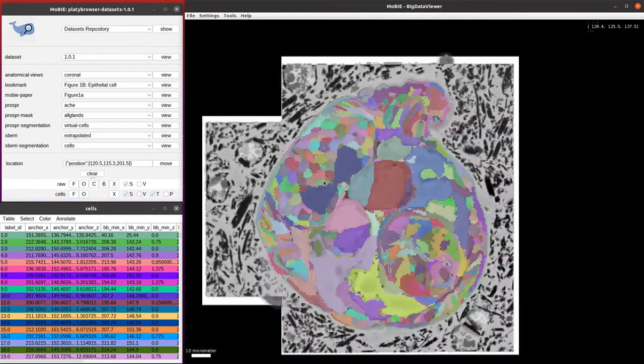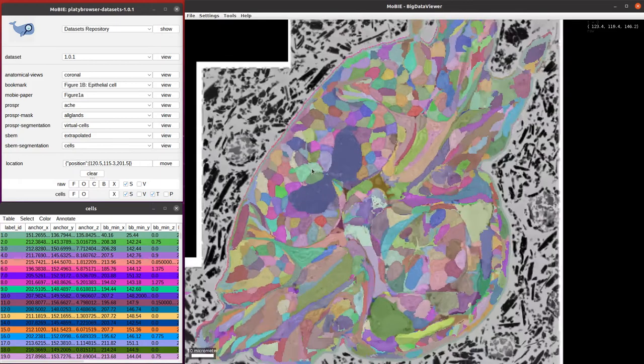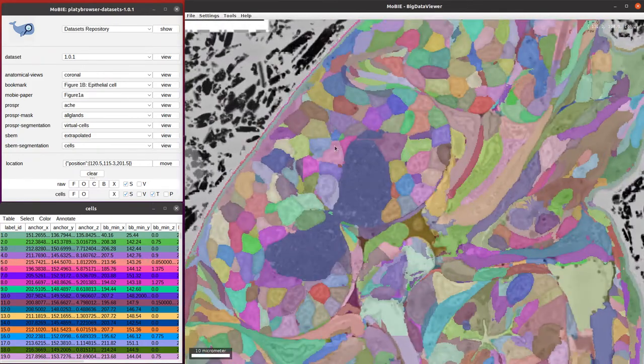If I scroll through in Z, you can see how they're all arranged in 3D. If I zoom in, you can see more of the details of those cells.